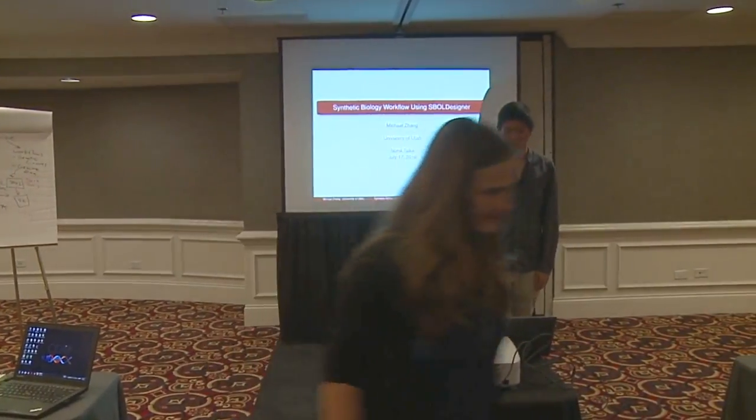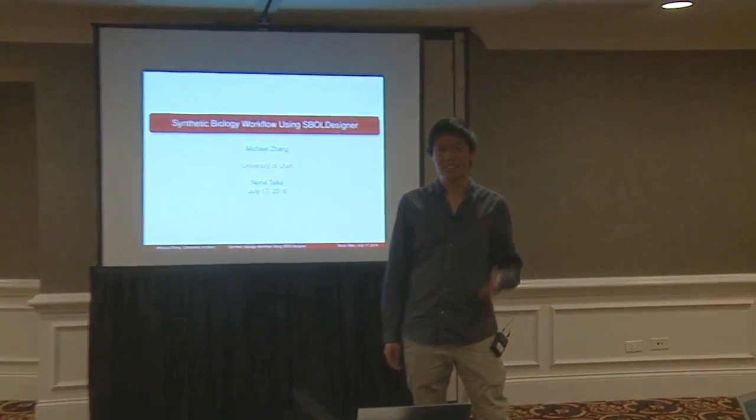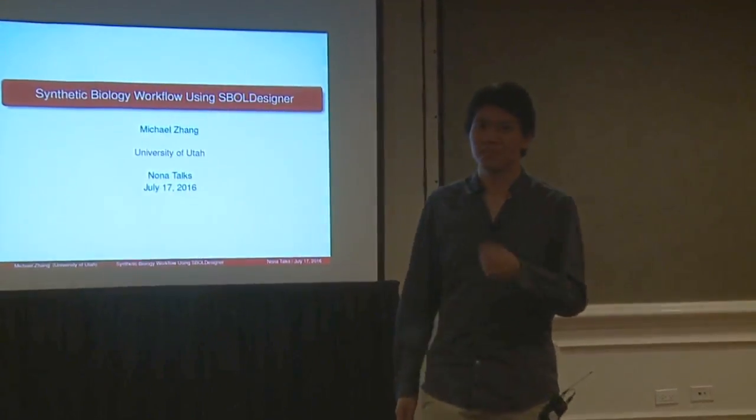All right, thanks. It's my pleasure to be talking to you guys today. I will be going over a synthetic biology workflow using SBOL Designer.